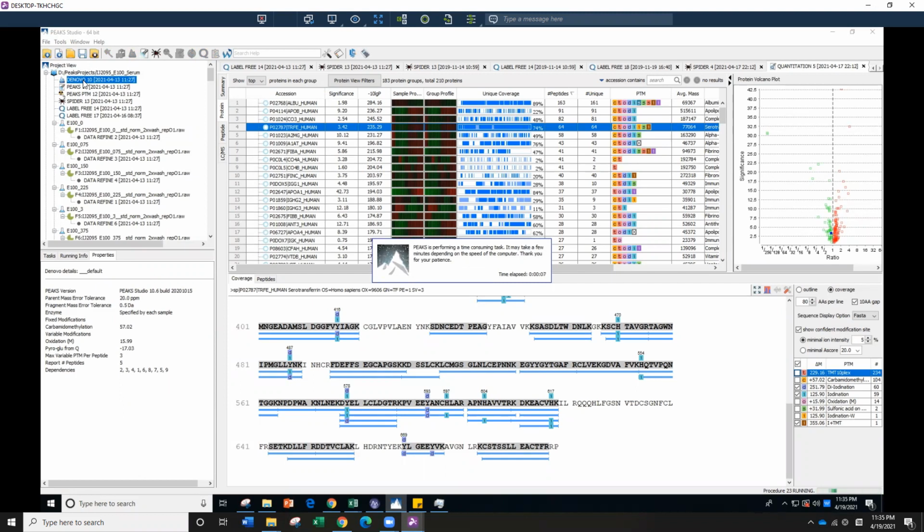What it does is take all those three-dimensional data into the computer and calculate the theoretical peptide sequence for you. That's the first step. It tells you how many MS1 spectra you have, how many MS2 spectra you have, and how many peptide sequences according to the calculation we have for mass spec.